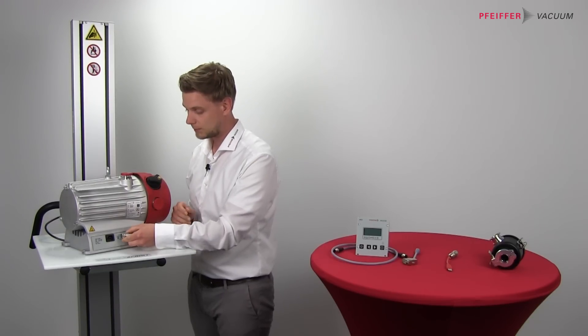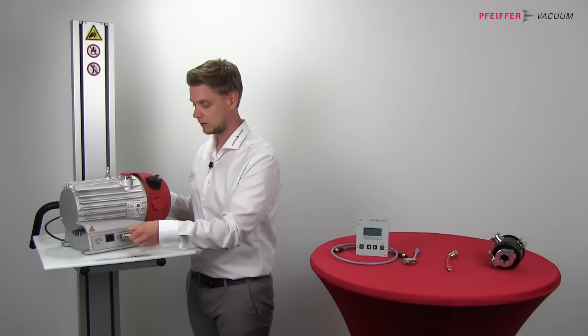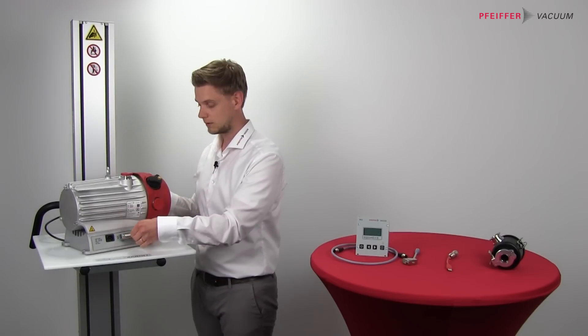This is the plug which will be connected to the Sub-D connector, then you should tighten the screws.